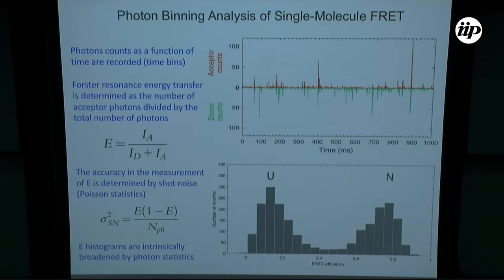And then what you do in order to calculate the FRET, or Förster resonance energy transfer, is something like this, rather than using the formula that I used before for bulk. In this case, I can simply get the same number by counting how many photons from the acceptor I see, so how many reds, versus how much of the total, which is red plus green. You can work the math. In principle, it's equivalent, right? So this seems like a very simple measurement to make, right? An analysis.